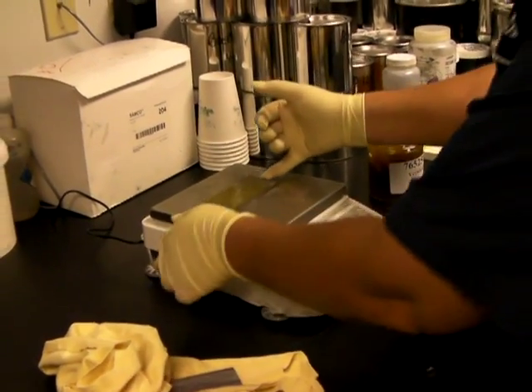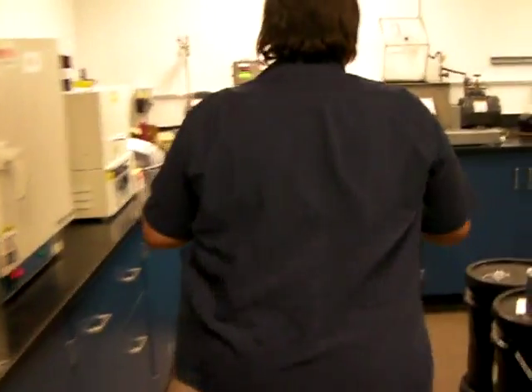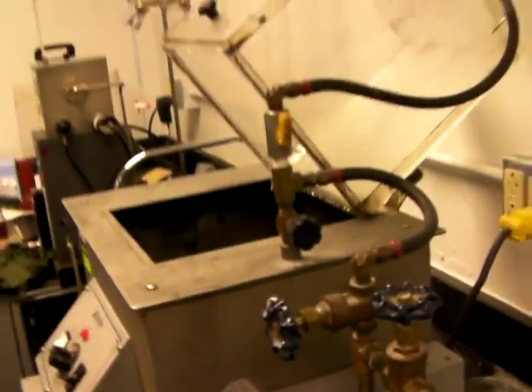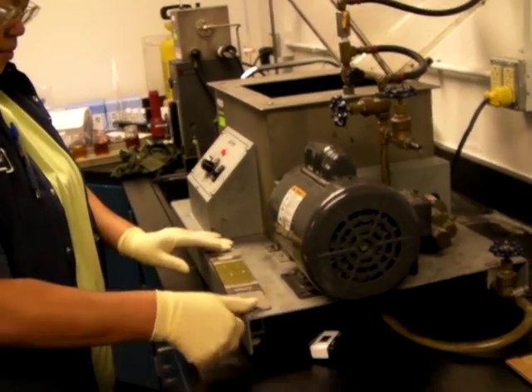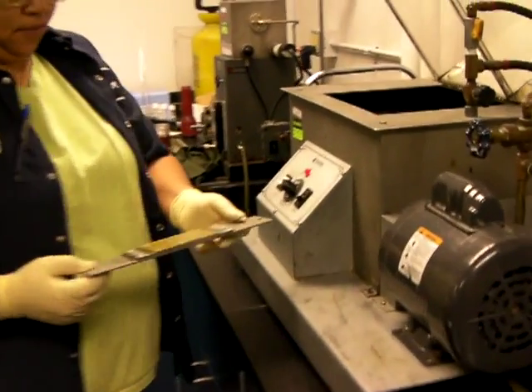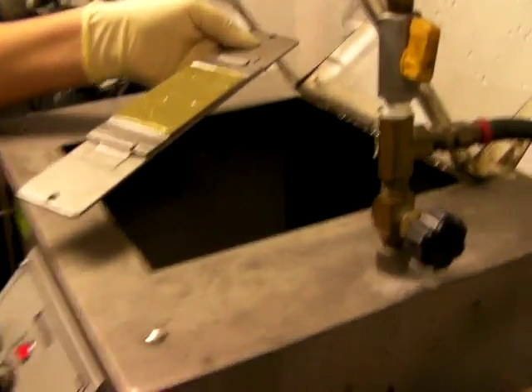And then weigh the plate a second time so we know exactly how much grease we have on there. And now I'll go to this side. This is the machine that does the work. First of all, she fits the plate into a special holder, and it goes in.